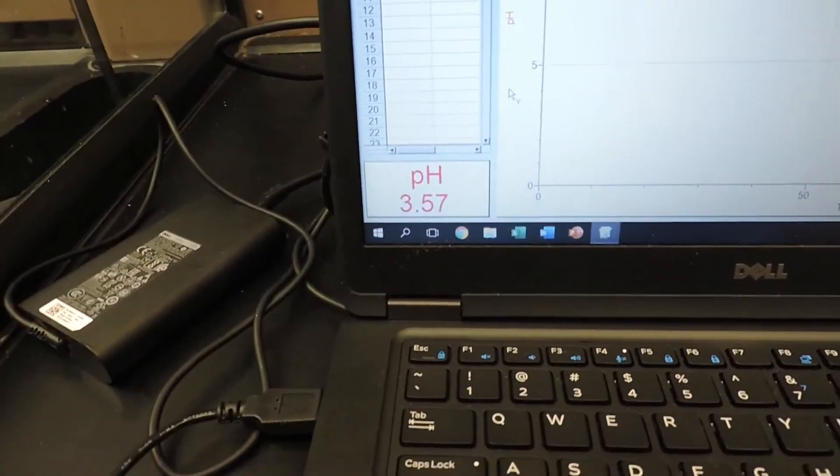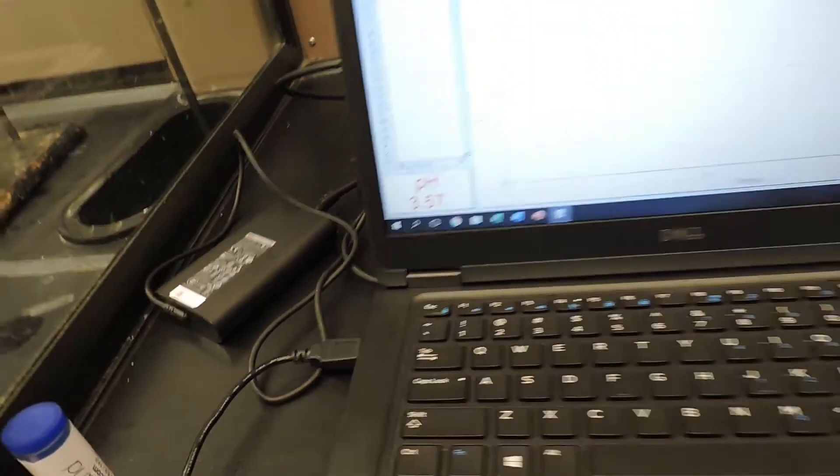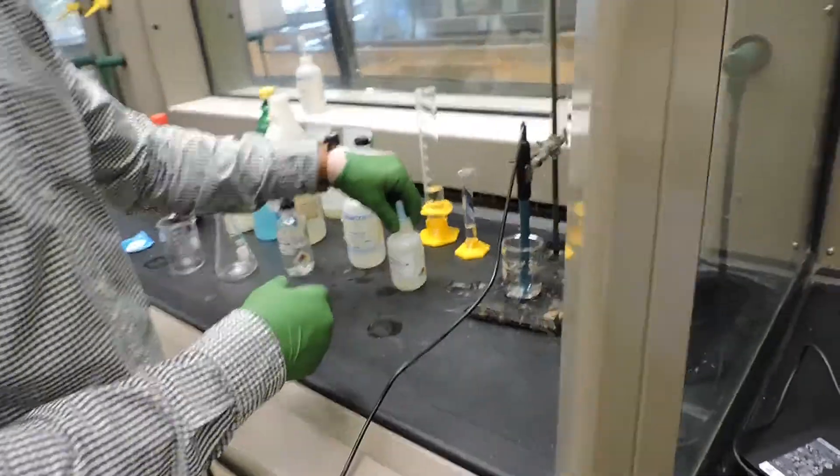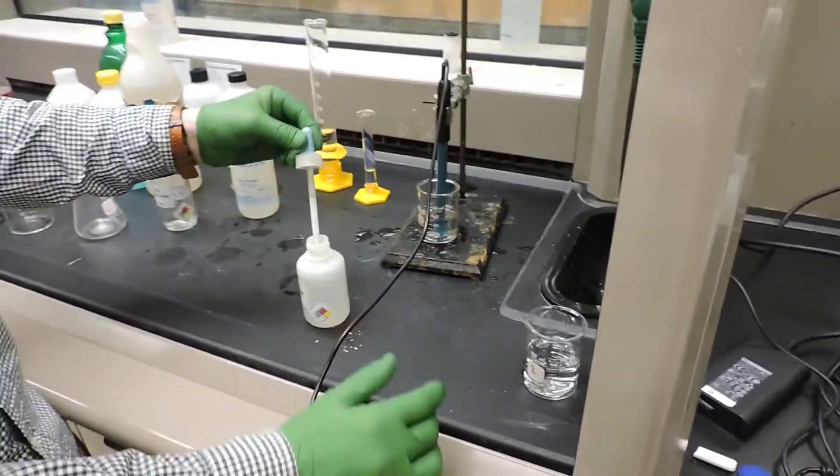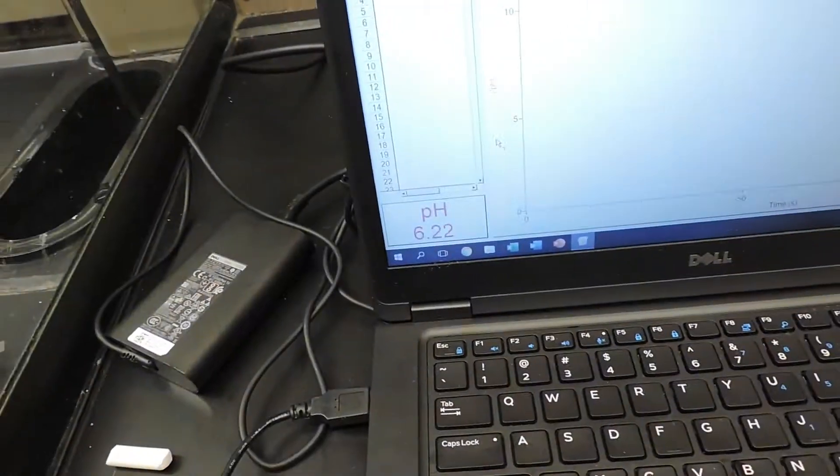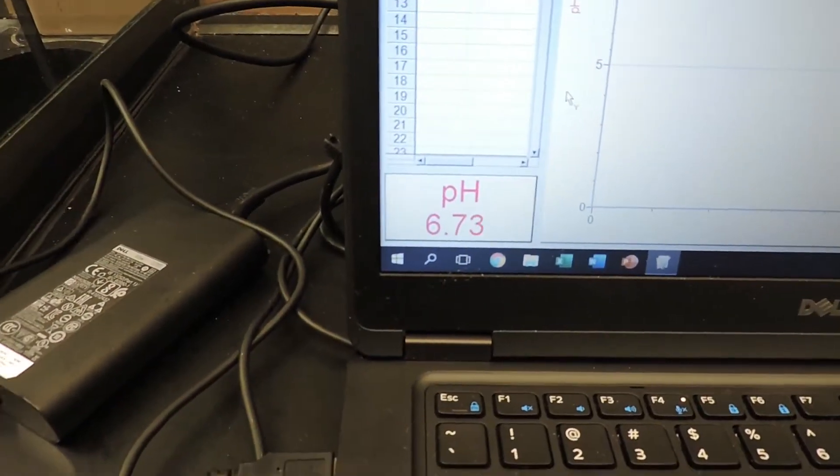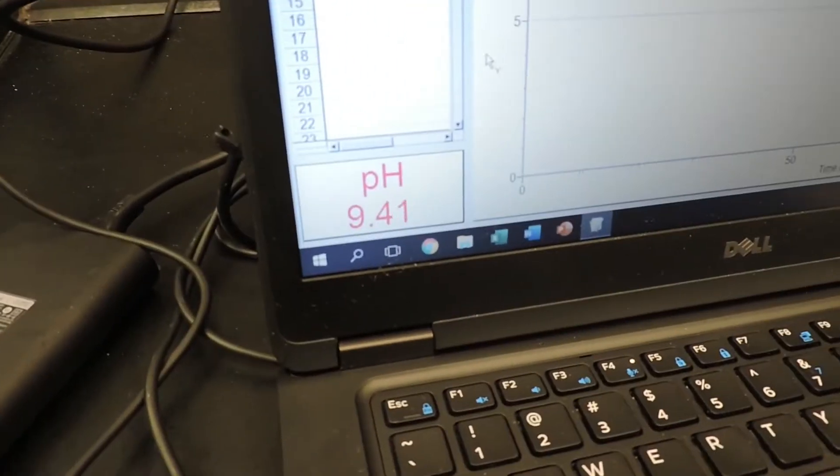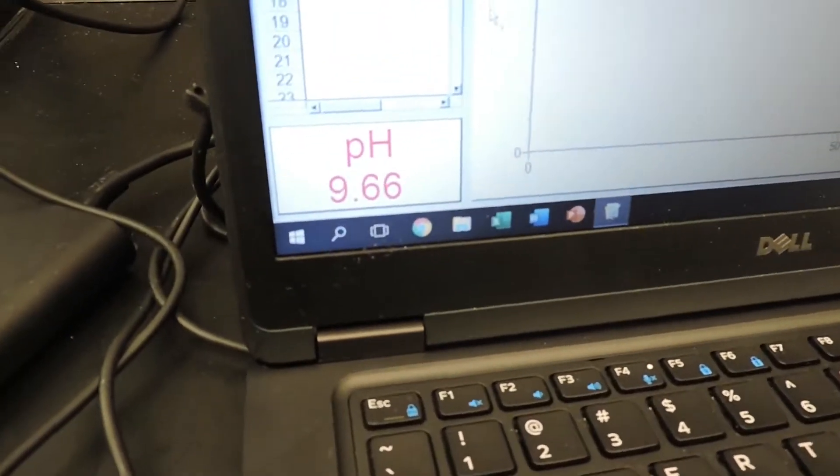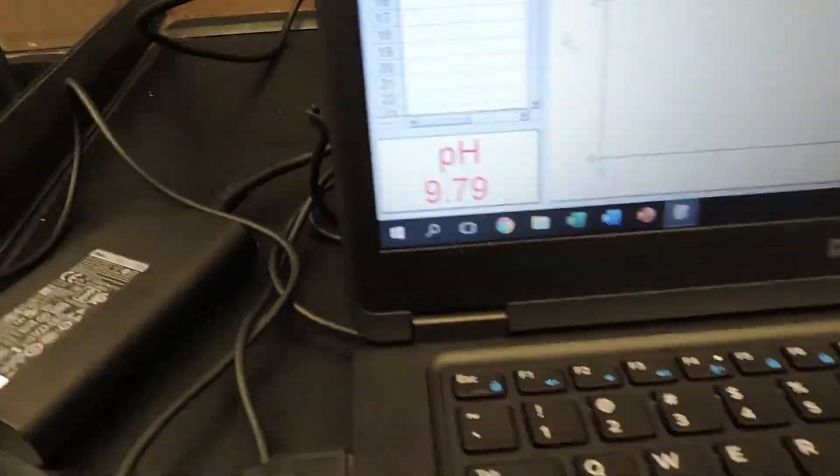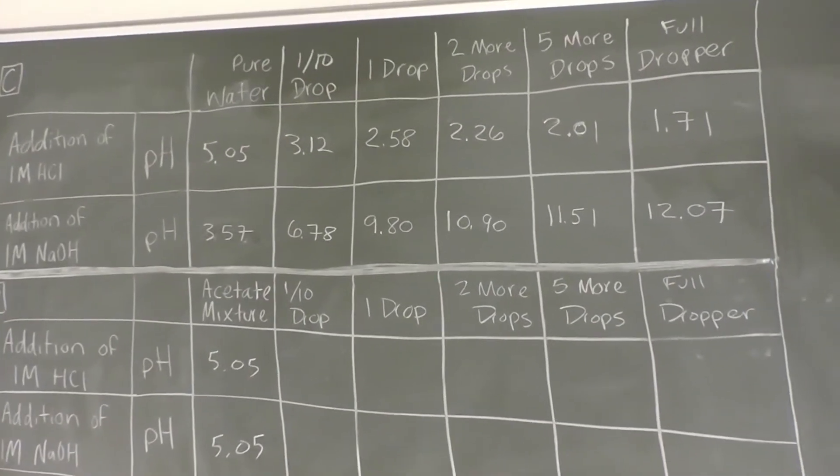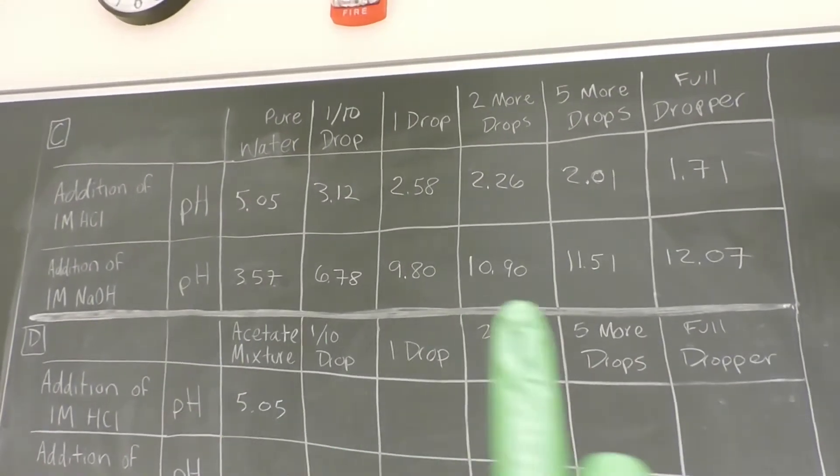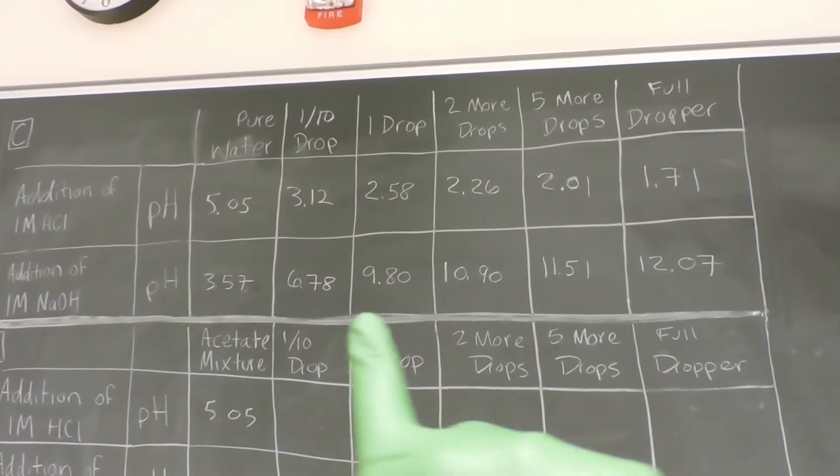We'll record this as 3.12 for our one tenth of a drop addition of hydrochloric acid. So the pH we're going to use for the water in the beginning of the sodium hydroxide addition is 3.57. We're going to do the same thing with the sodium hydroxide. We're going to add a tenth of a drop, one drop, two drops, five drops, and then the full dropper. These are the total pH values after adding different amounts of the acid and the base to just DI water.